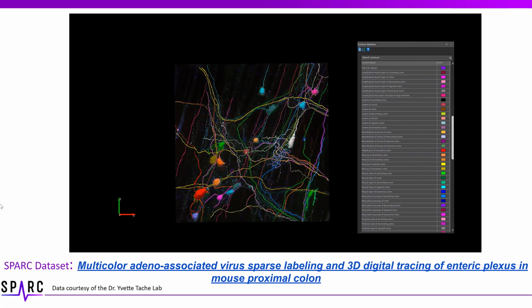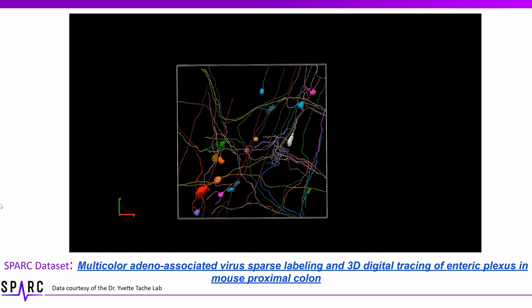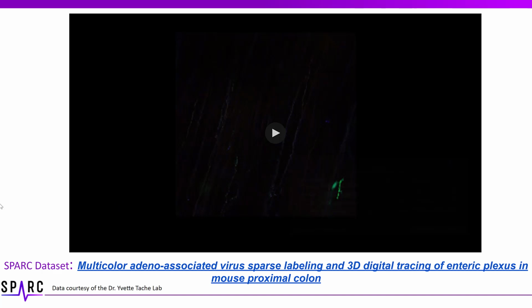Lastly, use the SPARC vocabularies provided through API connection to SciCrunch infrastructure to segment and annotate anatomical features and identify fiducial points or regions for scaffold registration. This 3D segmentation data is provided for scaffold fitting and registration through Pennsieve.